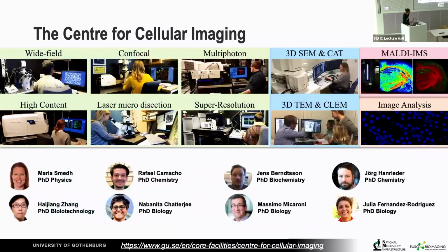The center has a wide range of services. We go all the way from wide field to super resolution microscopy. We are also heavily invested in 3D electron microscopy with the scanning electron microscope and the transmission electron microscope. Recently, we also have a pilot service on MALDI imaging mass spectrometry. As you might see, we are really a multimodal facility. The thing that I like the most, that's the greatest fun for me, is to start to correlate all of these imaging modalities together.